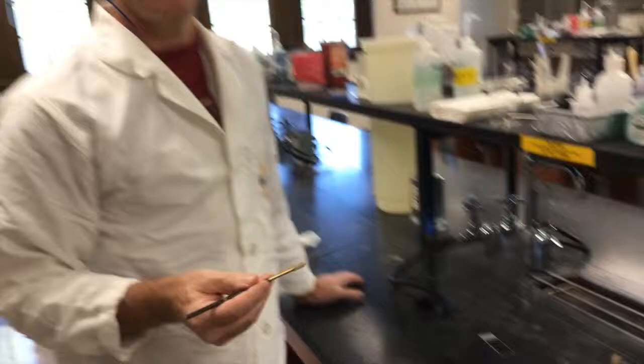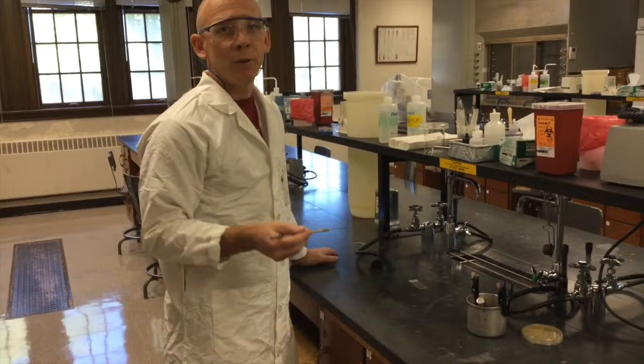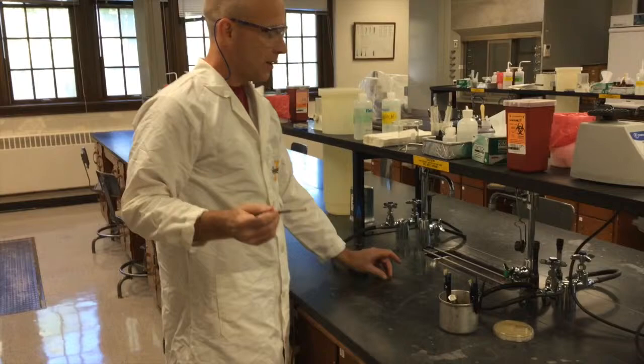Grab yourself an inoculating loop. And I'm going to put on two different kinds of samples: a liquid sample from a broth culture, and a colony from a plate. They're slightly different how you apply them to the slide. We're going to do this aseptically, so you want to work around the flame. Make sure you have all the materials necessary.